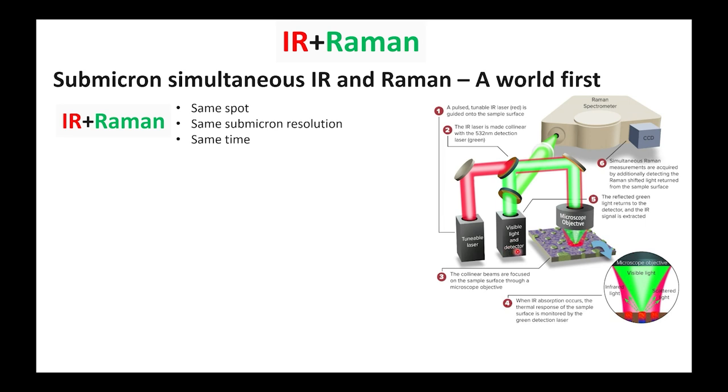There are no traditional infrared detectors that often require cryogenic liquid nitrogen cooling. So from that visible detector, we extract out the infrared signal through the modulations. But because we are using a Raman grade green laser, you've also got Raman scattered photons. They're always there, whether you use them or not, whether you like it or not. It's effectively a side effect. So we're taking advantage of the fact that there are Raman scattered photons there which are shifted in wavelength.